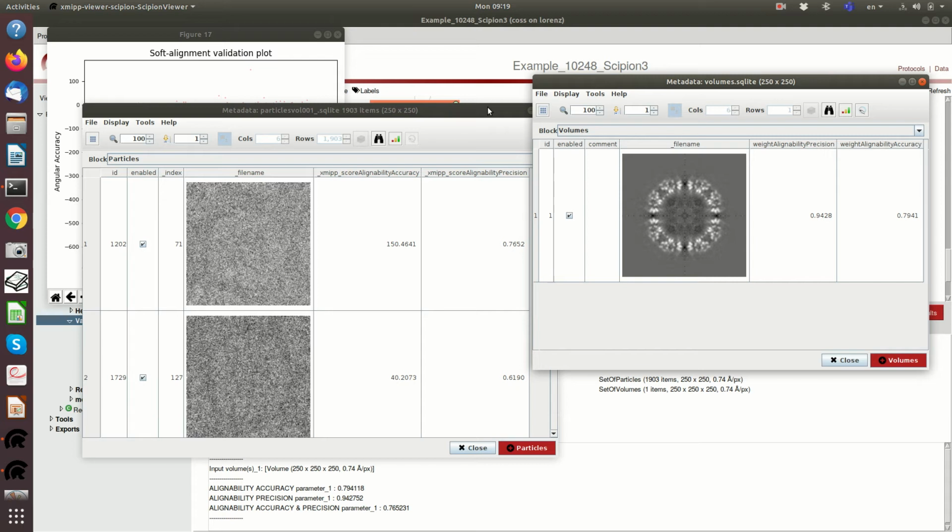So once you have converged, you make a global angular assignment again, and ask how likely it is that it receives an angle that is again close to the angle that you had in the previous reconstruction.